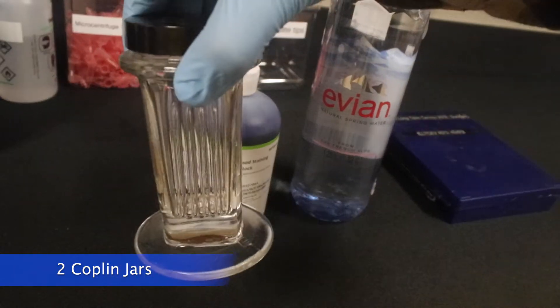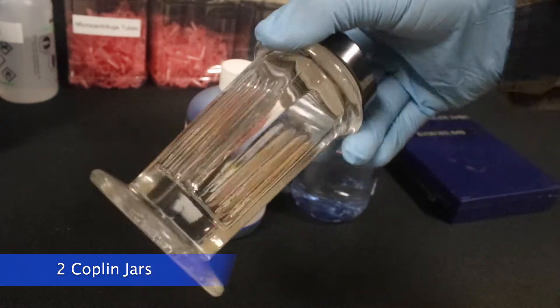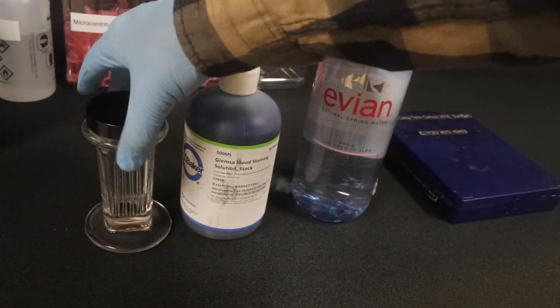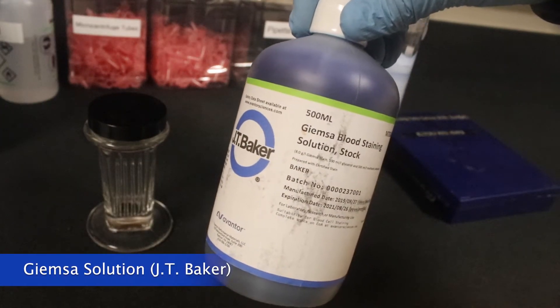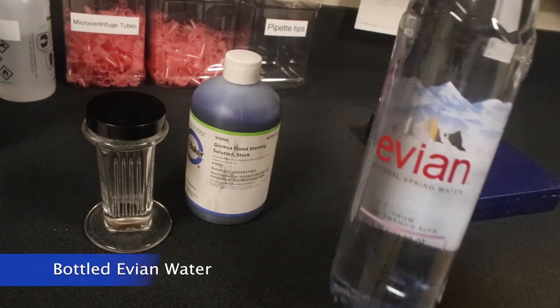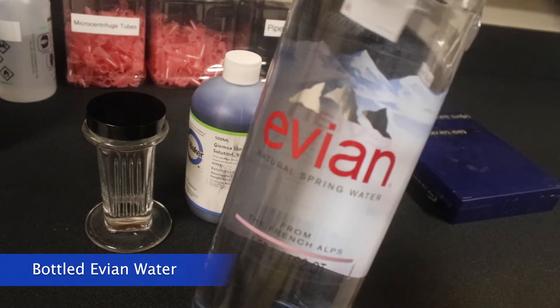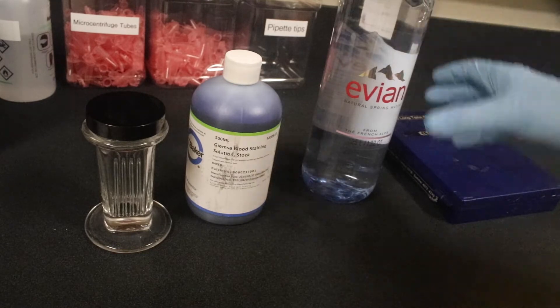One is going to be for the slides while they stain, and another is going to be to rinse off the stained slides. Then there's the Giemsa stain solution, and we're going to need this small bottle, not the taller one that we may have in the cabinet. Then we use Evian water as our buffer for this solution, and that is because it has just the right pH of 7.